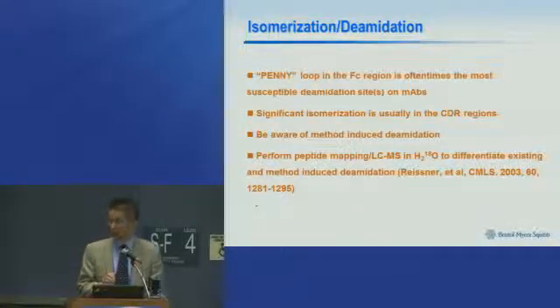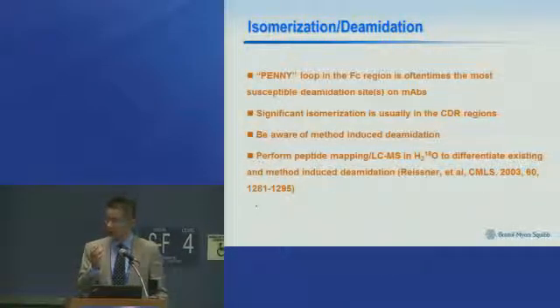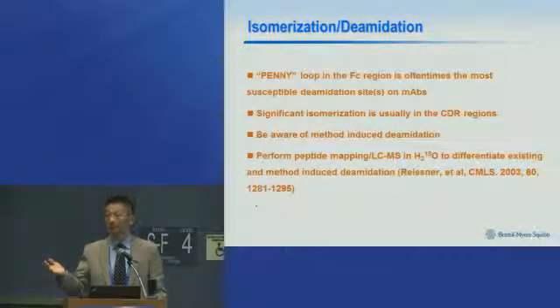Another point I would like to make is method-induced deamidation. The protein molecule has more constraint from conformation, so the flexibility between amino acid residues is more constrained than after you cut into peptides. So almost always after you cut into peptides, the deamidation goes much faster.